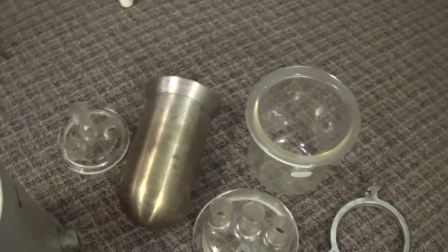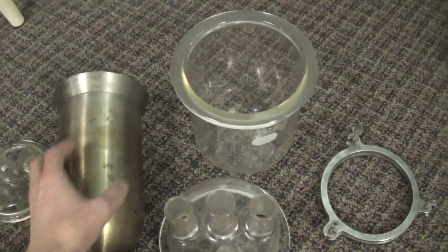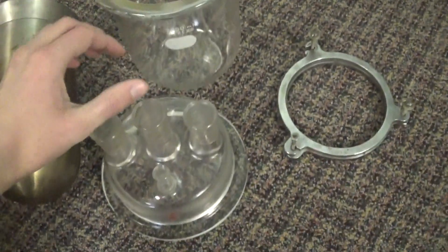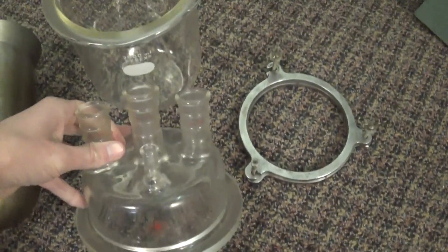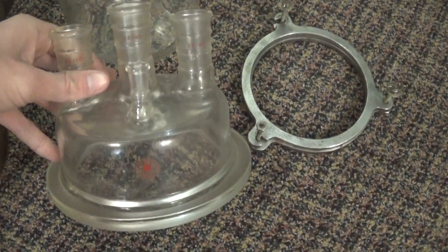This was local. I got a 2-liter stainless steel reaction vessel, a 2-liter glass reaction vessel, and two different glass lids. One has three 24/40 joints, and one — I don't know what size that is.